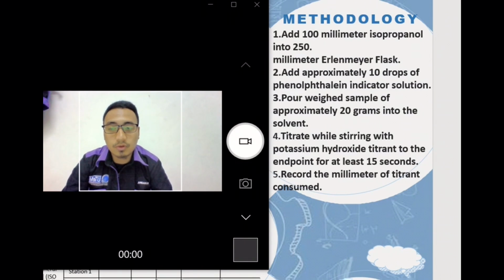Today, I want to continue about this lesson, which is total acid number. I want to explain about the procedure methodology.